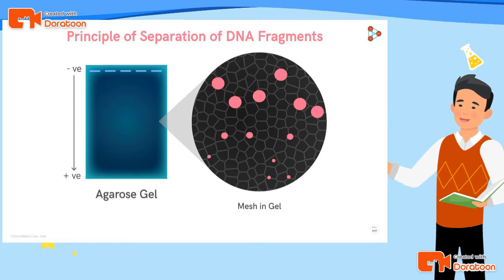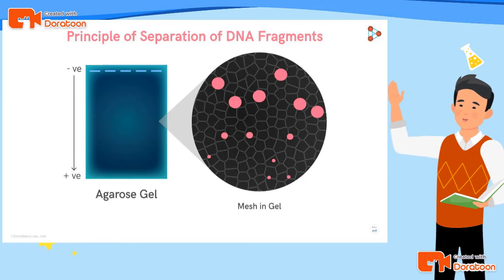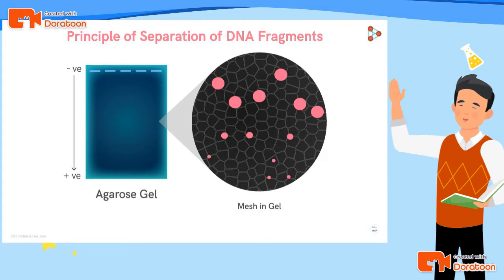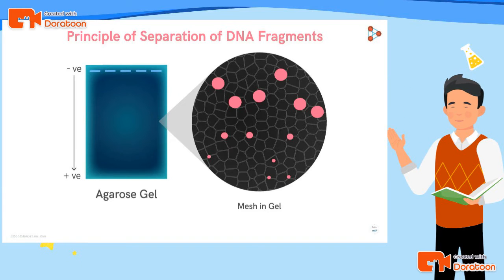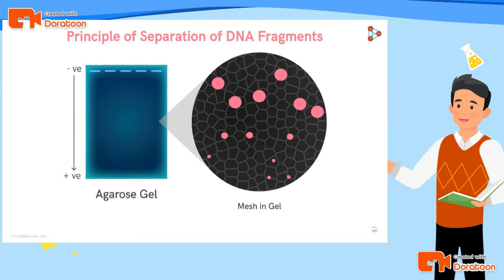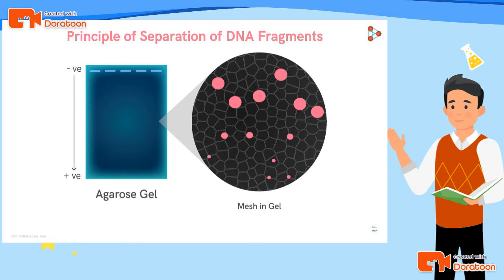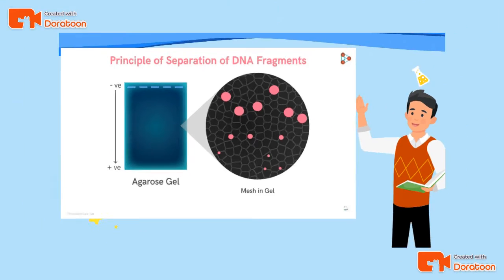If we look at the microscopic level of the mesh in the gel, we find that when different size DNA fragments are made to pass through these pores, it's obvious that the small-sized fragments will escape the pores quickly, while the larger fragments will find it difficult to come out. This is how we can understand the principle of electrophoresis separation of DNA.